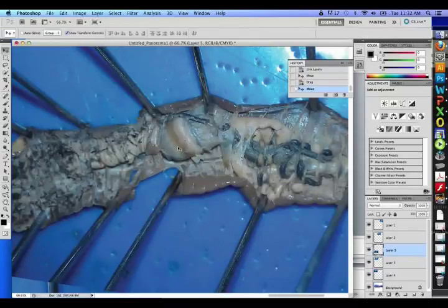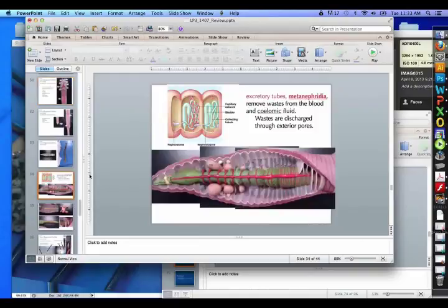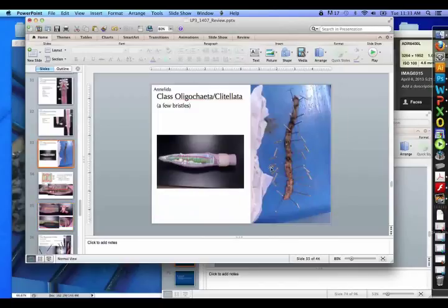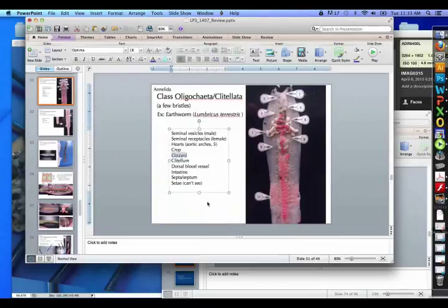And then we have the gizzard, which is, if you poked it, it would be a harder structure. And that's going to be where the food's ground up. So if we go back here, here's the crop at number 8, and then the gizzard is at number 9. And they have bulbous parts on here. So the crop and the gizzard. Crop's first, gizzard second. They don't have teeth either, so they have to grind it up in their gizzard. That's this word.